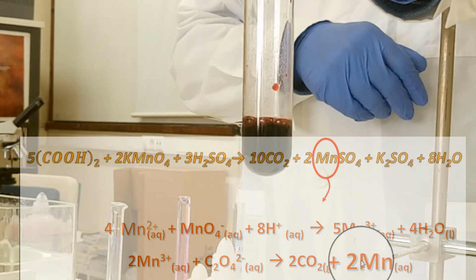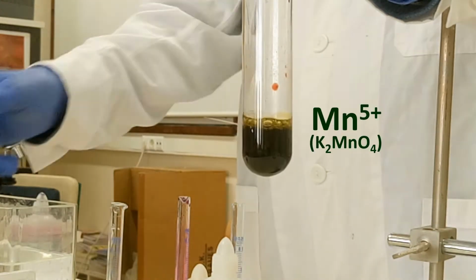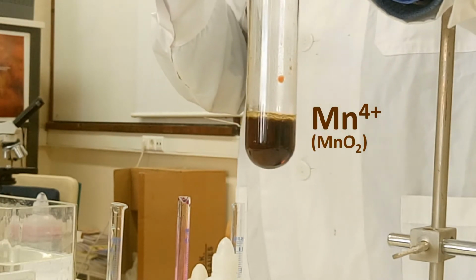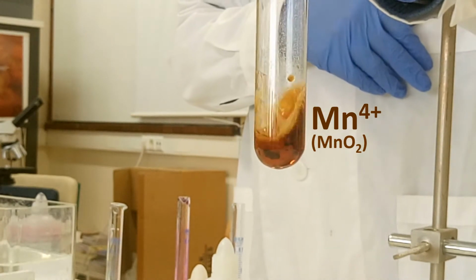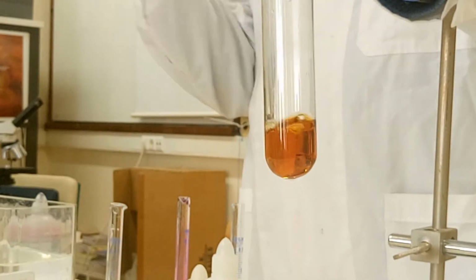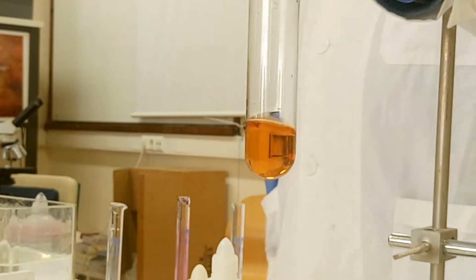If you do the maths, for each 4 bivalent manganese ions consumed in the first reaction, 5 are produced in the second. At the same time, color change is also observed as permanganate is reduced in a stepwise manner to manganate and to manganese dioxide. See that insoluble dark brown solid? That's manganese dioxide. If we mix it up, we set off the reaction again, and manganese dioxide is finally consumed and colorless bivalent manganese prevails.